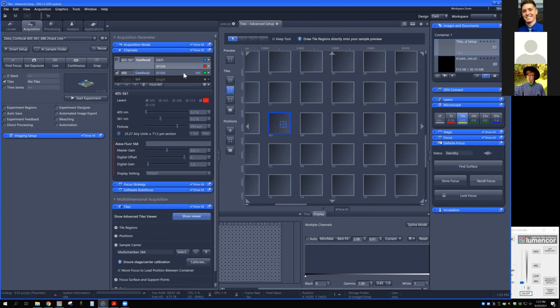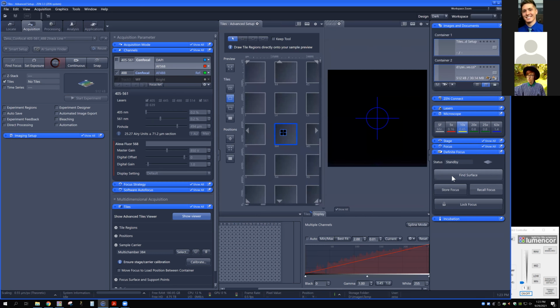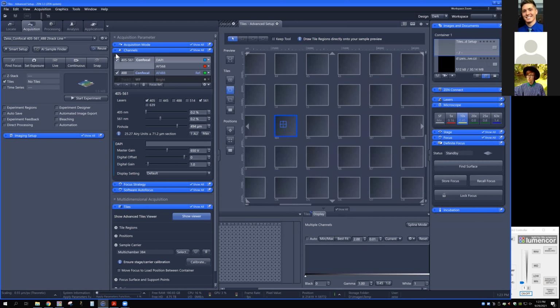It might be that we need to go to even higher power, because we don't see much of anything too. I'm not sure. You could try the well over too. Yeah. Okay.